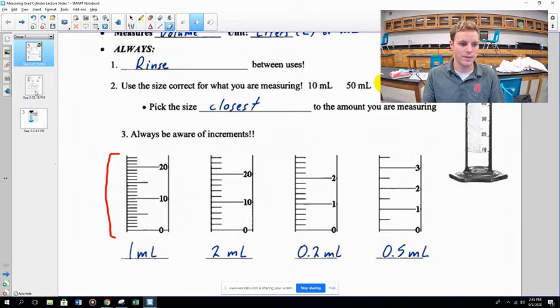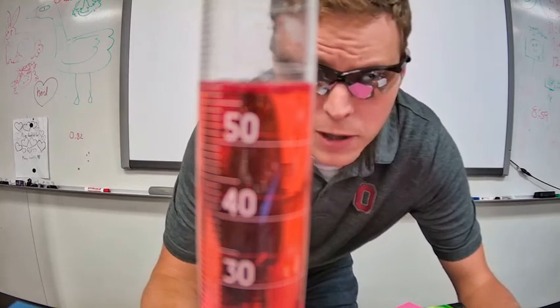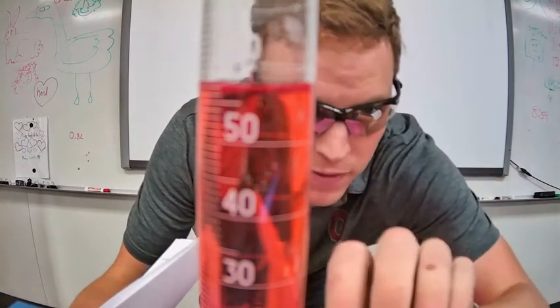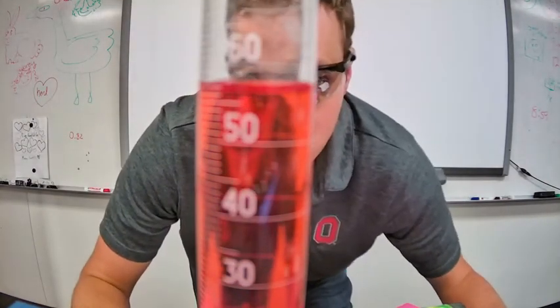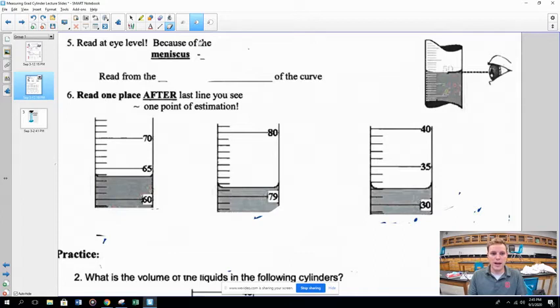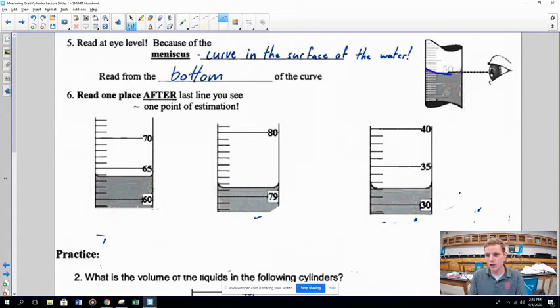When reading a graduated cylinder, always get down to eye level. This is because water has a slight curve at its surface called the meniscus. You can even see this at home in a tall skinny glass of water. Always read at the bottom of that curve, not at the top edges.